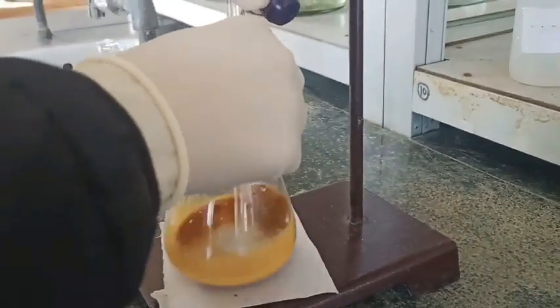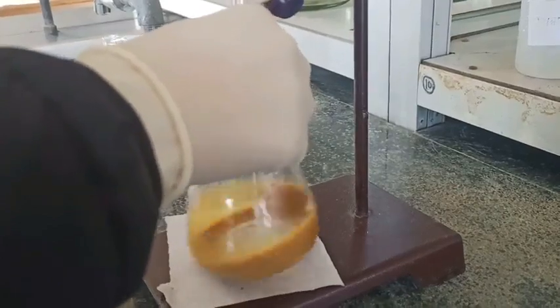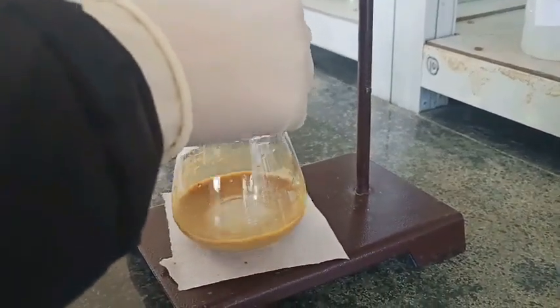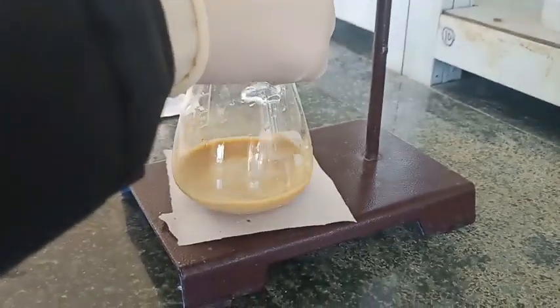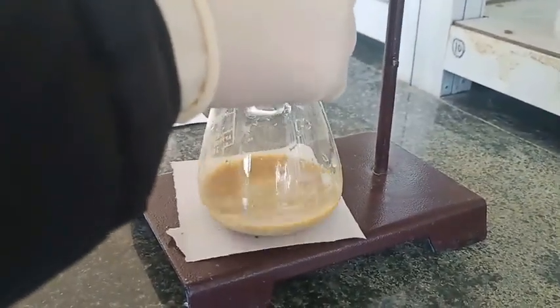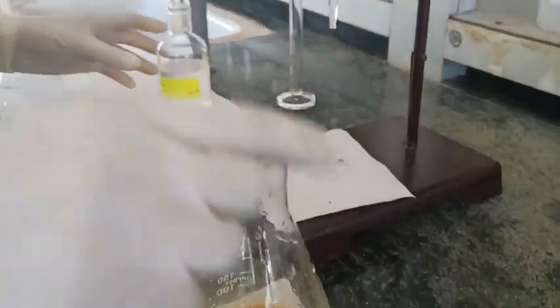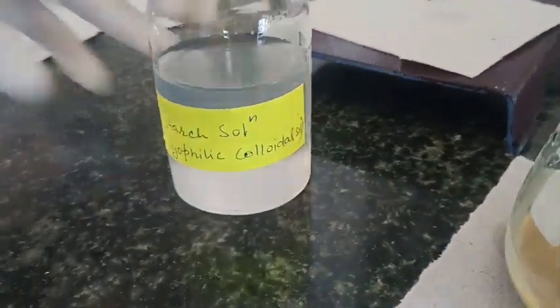So when this color has faded, I will add starch as an indicator. So here you can see the purple color of the starch iodine complex.